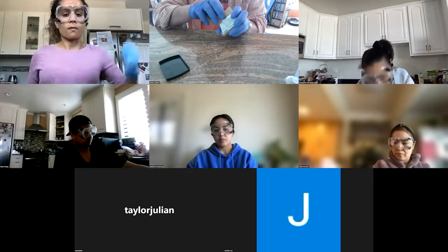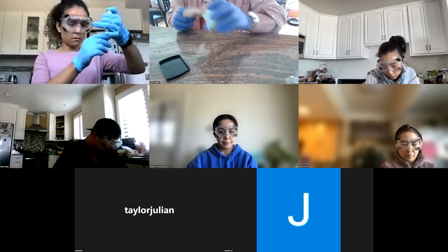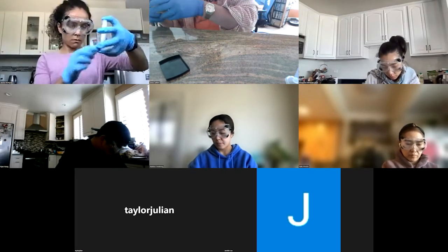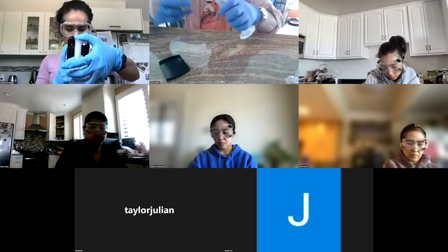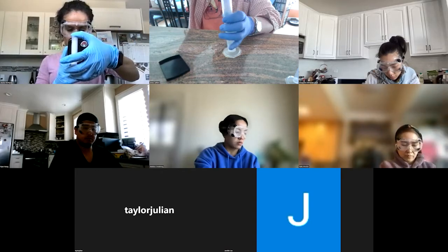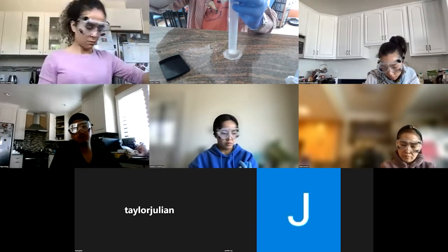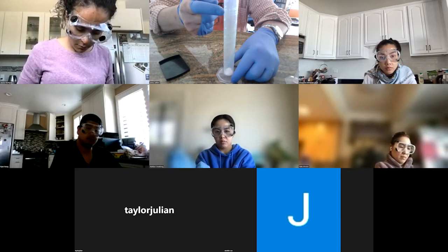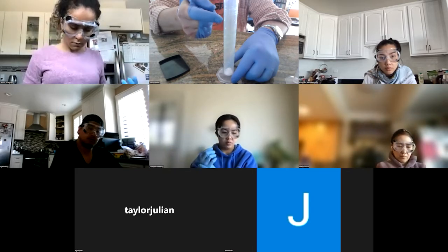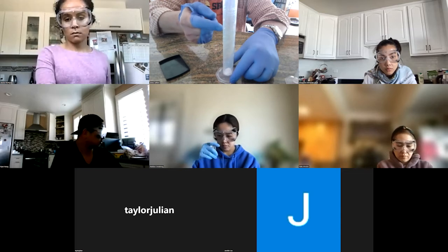Oh, looks like I got some solids in here. Hopefully it's enough. Let's pour that directly into the 50 ml. So you guys are probably going to want to add the 50 to it, shake it up, make sure it's all dissolved, and then take 25 mils of it and put it in something.